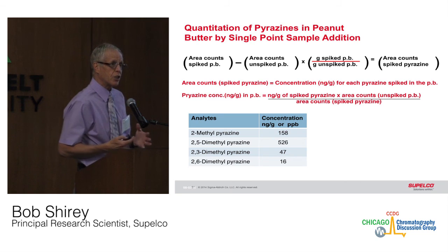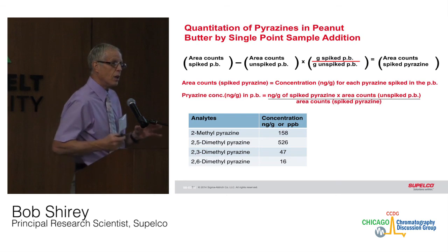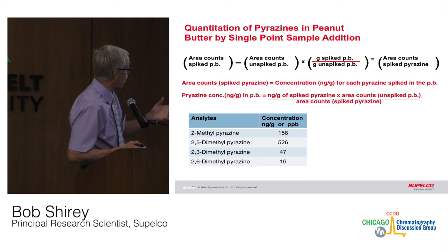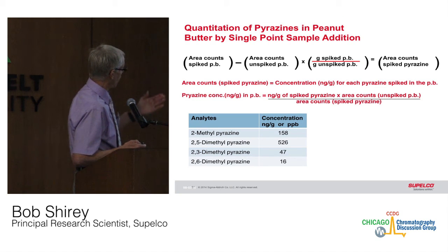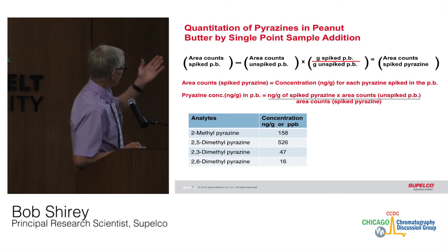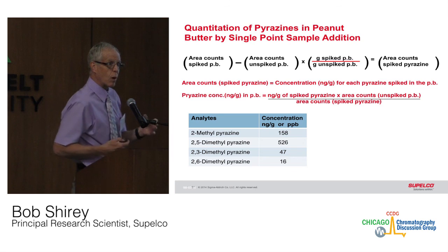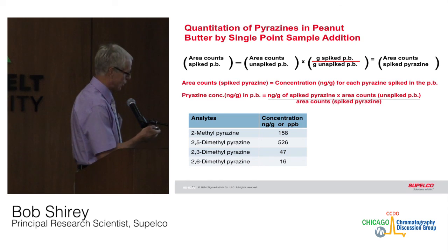Now, how would you analyze a food component when you don't have a similar matrix that doesn't have those components in it? One of the ways to do this is sample addition, where you would take your sample and divide it into 2 vials. You would try to get about the same amount of weight in each one. You would spike one of the samples with a known amount of the particular pyrazines that you wanted to analyze. You sample both identically, and then subtract the unspiked from the spiked, and that gives you the area counts for the amount that you spiked into it. Once you know that amount in relation to the area counts, you can do a direct proportion to determine how much was in the original sample.